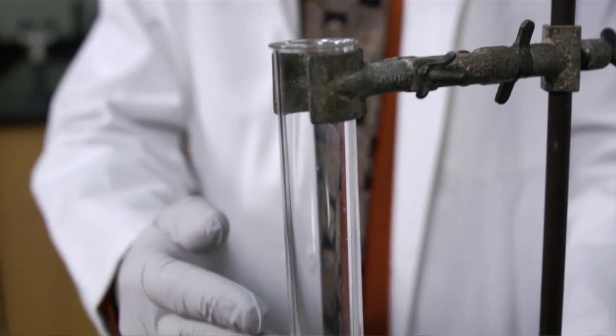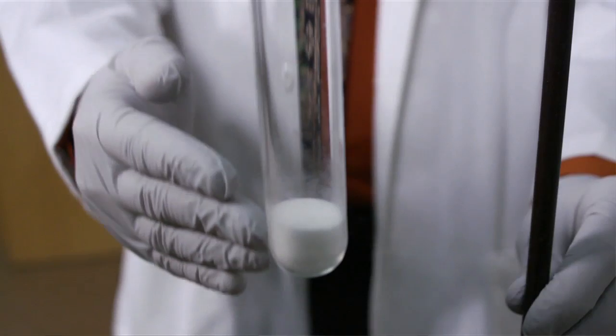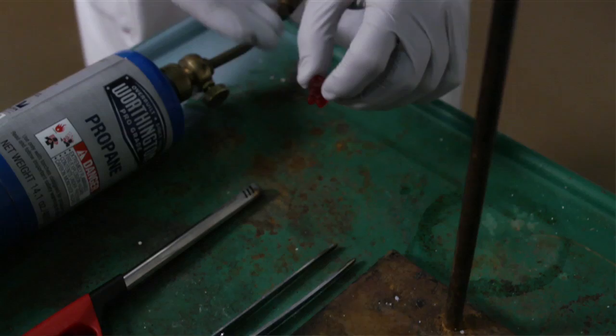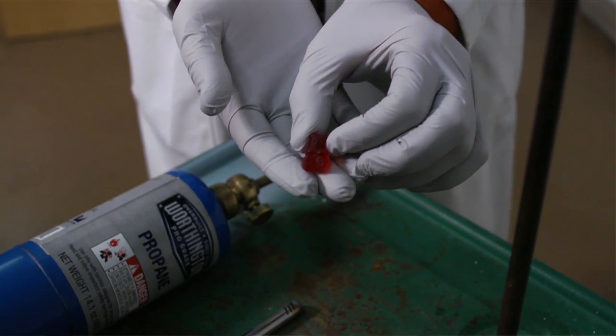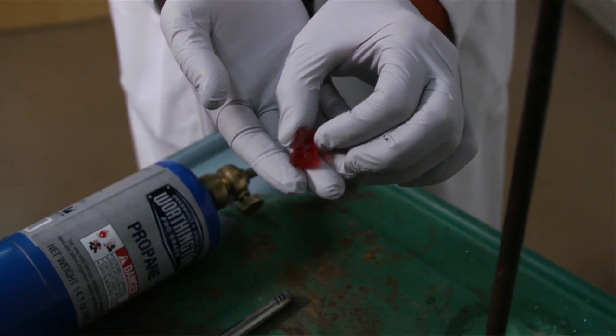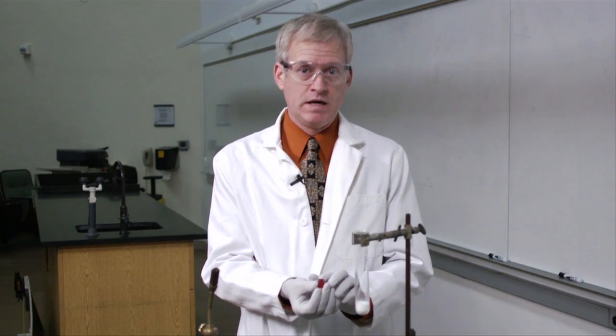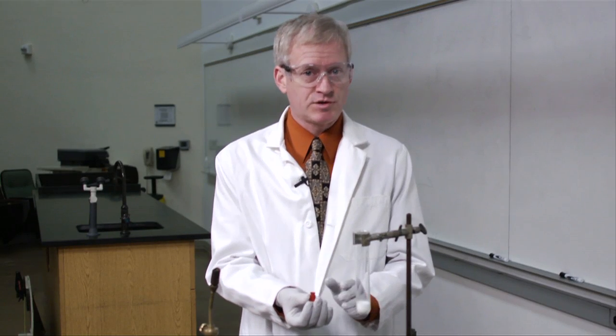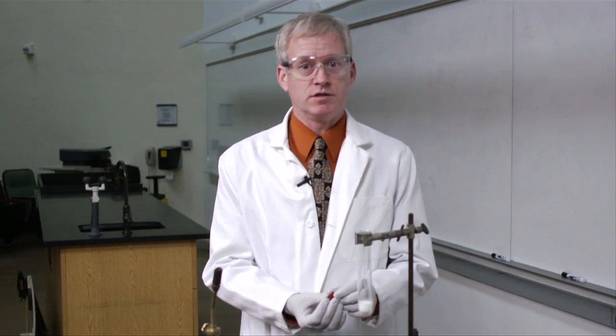In this test tube, I have some solid potassium chlorate, a strong oxidizing agent. And here, I have a gummy bear, a piece of candy that is essentially a mixture of sugar, starch, and gelatin. All of these are organic compounds that can be burned exothermically by a strong oxidizing agent.